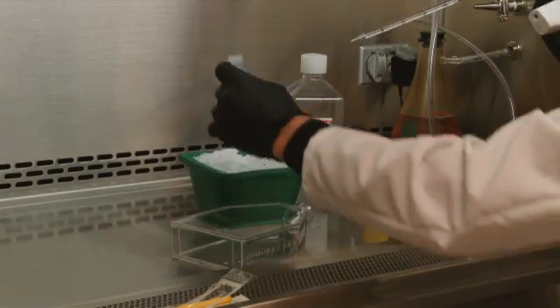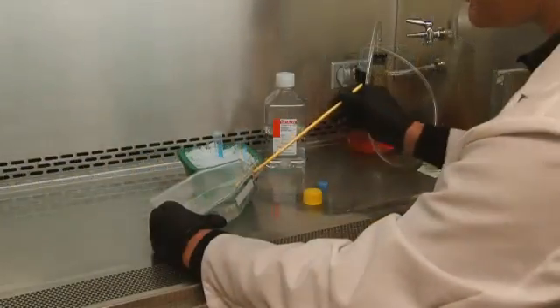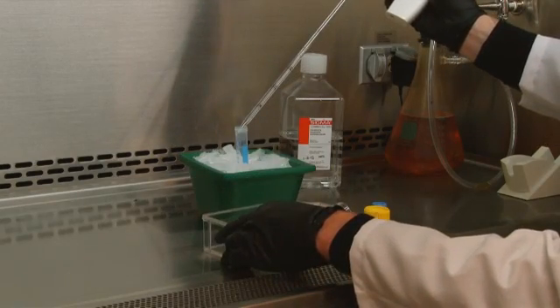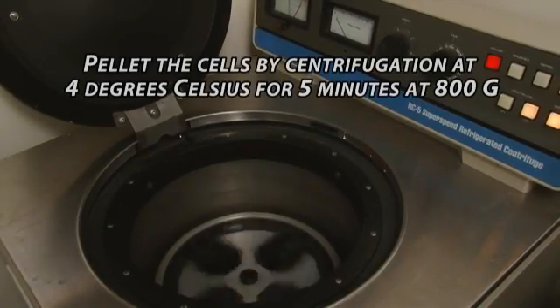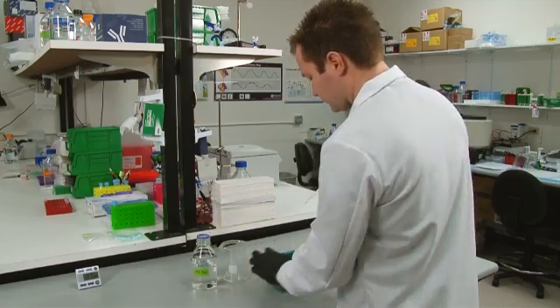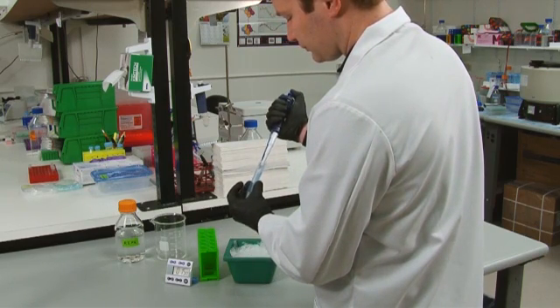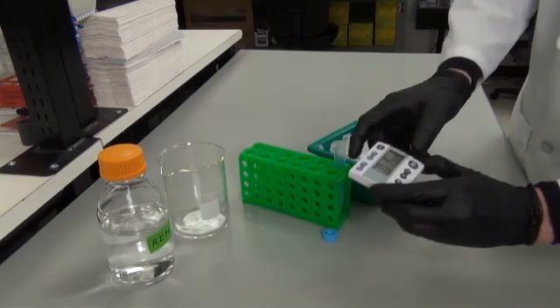Next, add 4 mils of ice-cold PBS that also contains appropriate protease inhibitors to prevent degradation of your proteins. Scrape the cells into solution and transfer to a 15 mil conical tube. Pellet the cells by centrifugation at 4 degrees Celsius for 5 minutes at 800 g. Discard the supernatant and resuspend the cells in 400 microliters of RIPA lysis buffer and appropriate protease inhibitors. Transfer the cells to a siliconized microcentrifuge tube and incubate on ice for 15 minutes. After this, you are ready for DNA shearing.